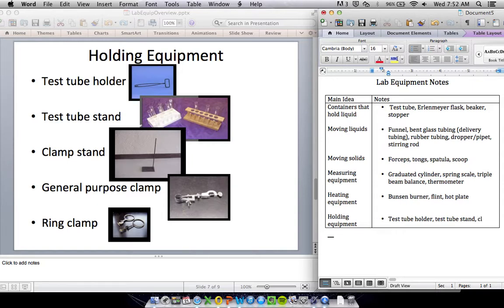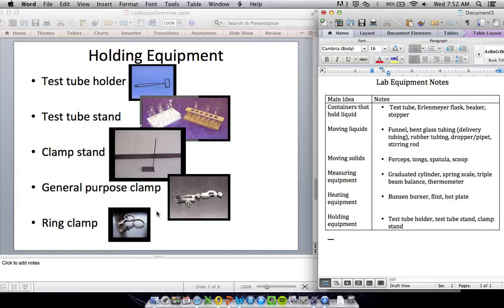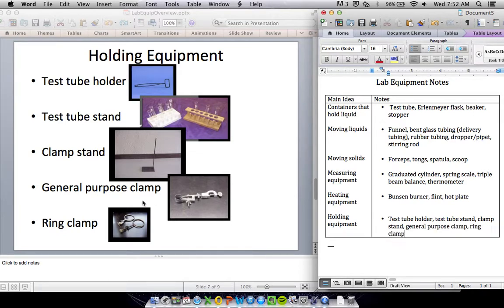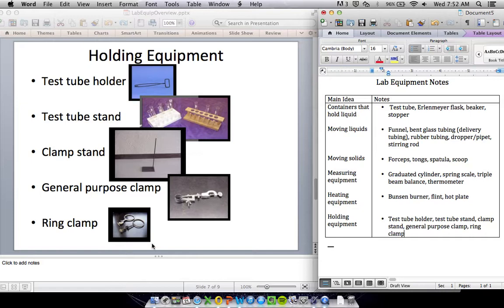You've got a clamp stand, which isn't very useful on its own. It's just this base with a pole sticking out of it. But you use these other clamps, like a general purpose clamp or a ring clamp. These will attach onto the clamp stand, and then you can attach other stuff to it. So you can see these ends will attach to this pole. Then you can balance stuff on the rings or tie stuff to them, or you can use the other end of the clamp to hold stuff in place.